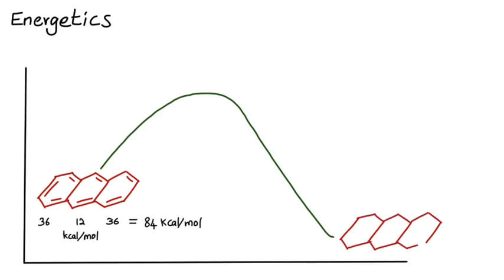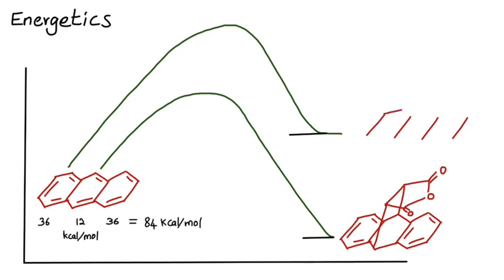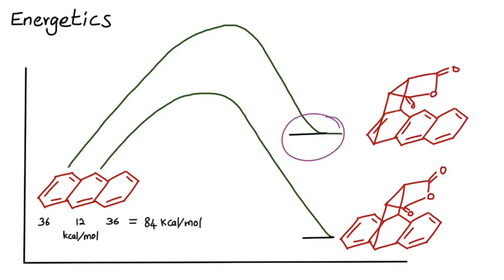Here is how the reaction takes place at the middle ring. If you break the outer ring, the product would be less stable, right? If you add the maleic anhydride to the first ring or the third ring, the product would be higher in energy, in other words, less stable.